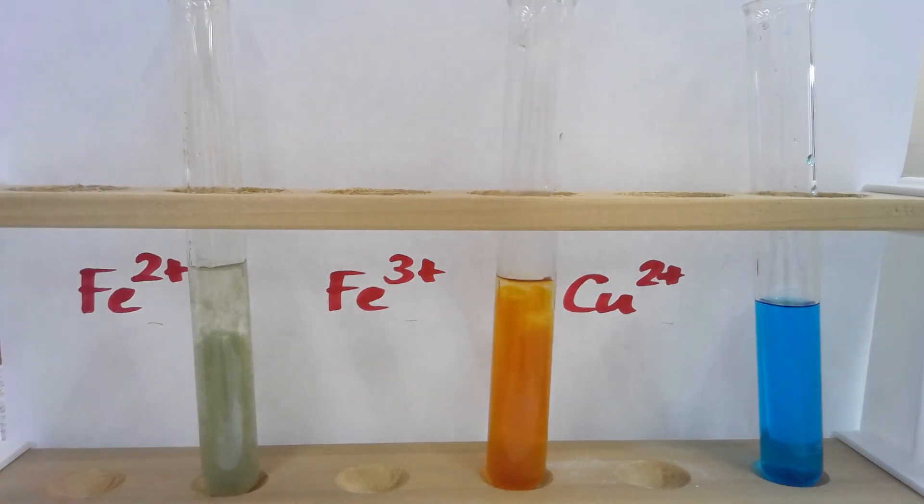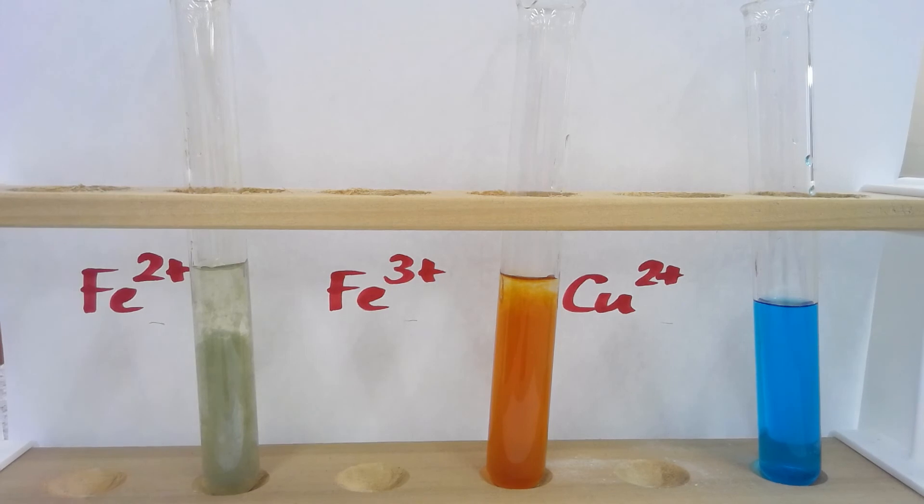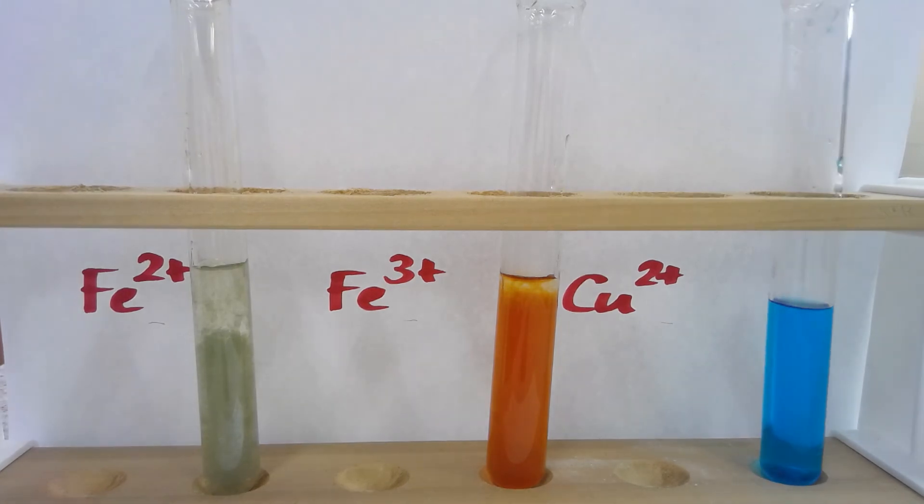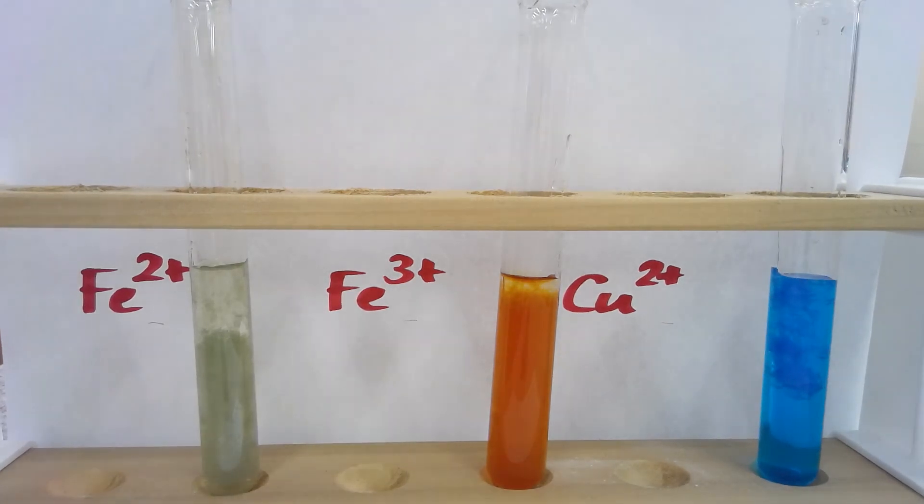With our Fe3+, we've just made an orangey-brown or rusty colored precipitate, and with our copper 2+ we make a blue colored precipitate.